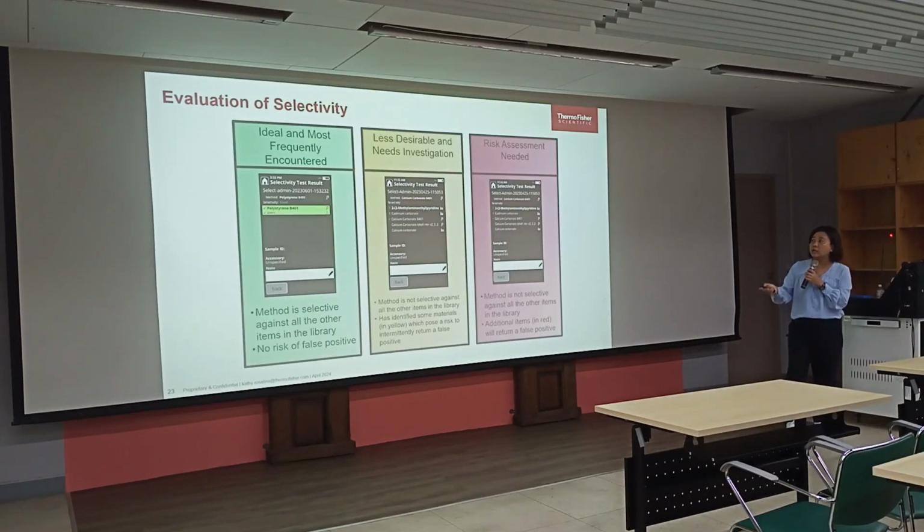But when you get a yellow color, it means warning. You have to investigate. Some of your method included in the factory library, or maybe in your user created library, there is a similarity. Then you must be careful. I have to check, investigate.